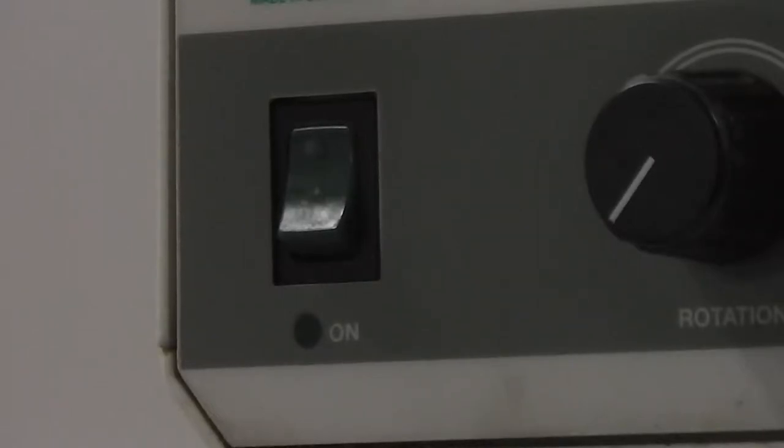This is the Buchi R114 Rotavapor. I killed the lights because I wanted to show you the power button. It does turn on.